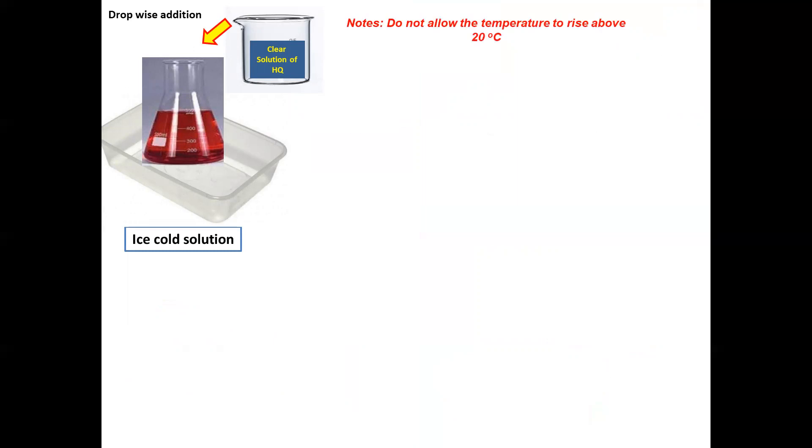Note: do not allow the temperature to rise above 20 degree celsius. After the addition of clear solution of hydroquinone drop wise, we get yellow product.